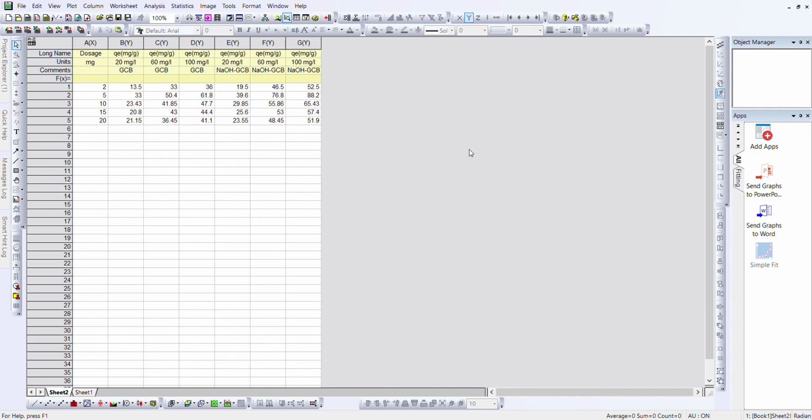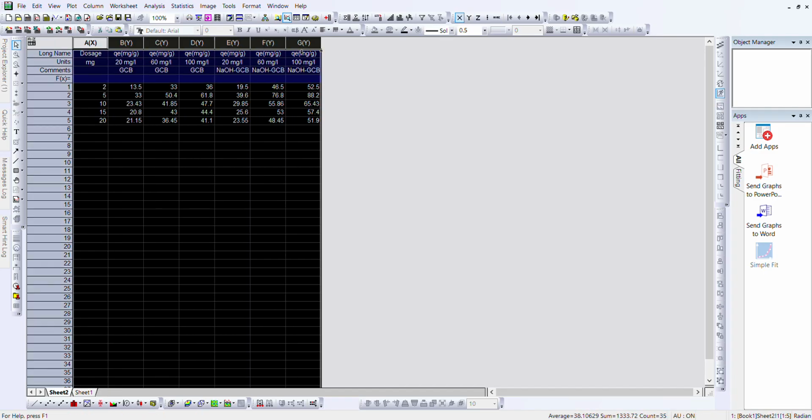So already what we have done, we have picked the data from here, so we just need to copy. Already the data is imported here, you can see, and also this is already here. Now what we need to do is select the data, then we will say plot, and then we will choose line plus symbol. You can also draw other plots.